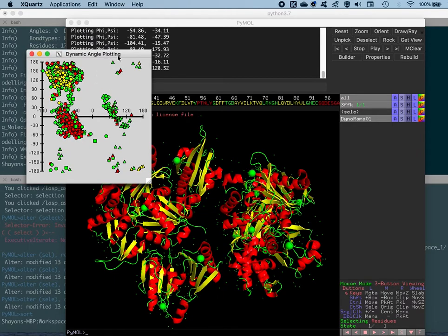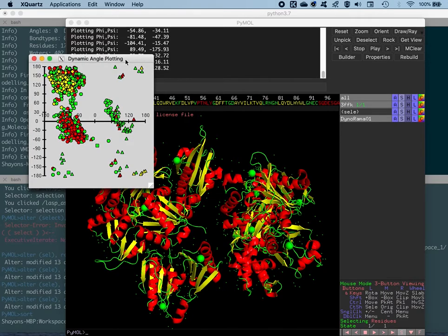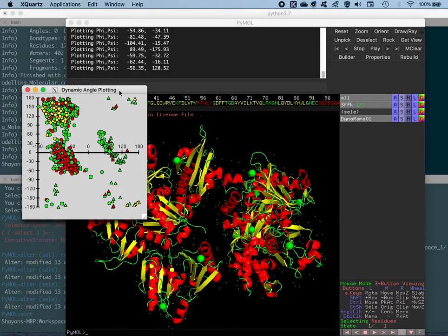All right, moving on. Another question that might come into your mind is how to save these figures. So PyMOL allows saving figures in the PostScript format, that's with the extension PS. So you need an Adobe Acrobat Reader or something that reads a PDF file in order to open those images, or you can convert it to a different format, let's say a TIFF format or a PNG format or even a JPEG format for that matter.